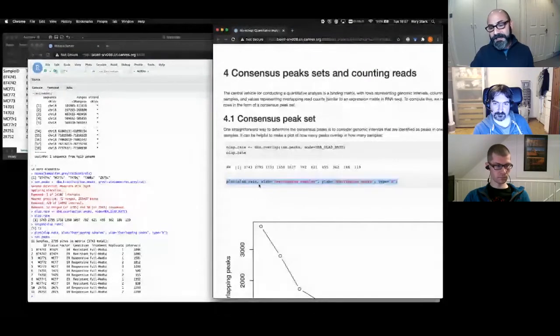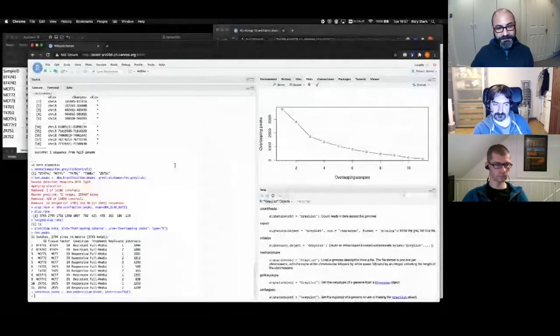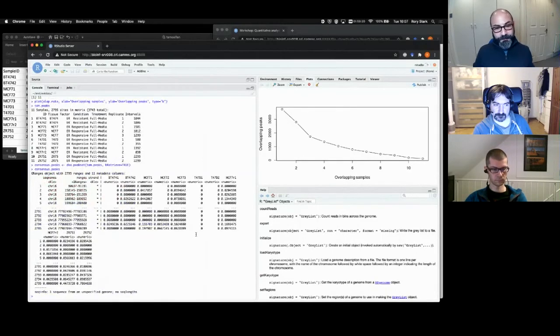And we can see the consensus peak set. We can retrieve it with the dba.peakset function. So I'm just saying retrieve this peak set, and then get that back as a GRanges. All of these are scores, so we can see, for instance, that peak 2794 was identified.